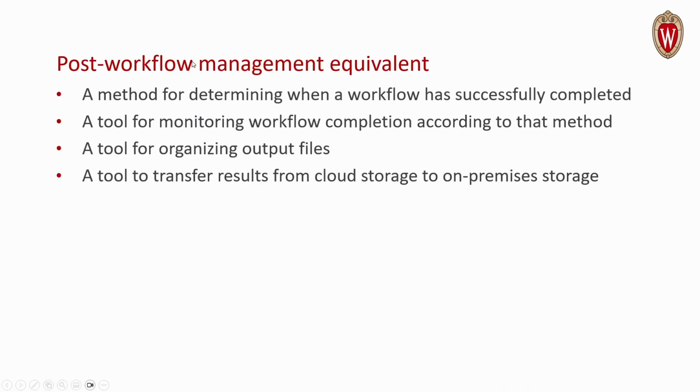So for post-workflow management equivalence, you would need a method for determining when a workflow has successfully completed, a tool for monitoring workflow completion according to that designated method. You would need a tool for organizing your output files, and a tool to transfer results from cloud storage to an on-premises storage.